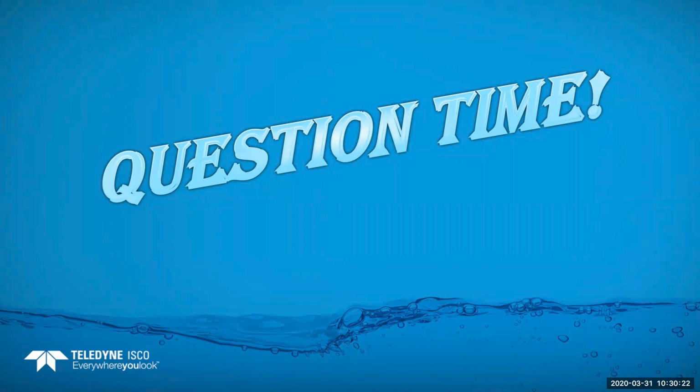There is a little bit of plus or minus every time it takes a sample. Sometimes you get a little bit more, sometimes a little bit less, but usually that's not enough to go over. If you find that you are overfilling or getting too much sample, then you can either drop the number of samples, go down to 90 samples, or say, okay, I only want 95 milliliters every single time for the aliquot. You just have to play around with it and get it so it works for all situations for you. It can be difficult. A lot of times it's trial and error.